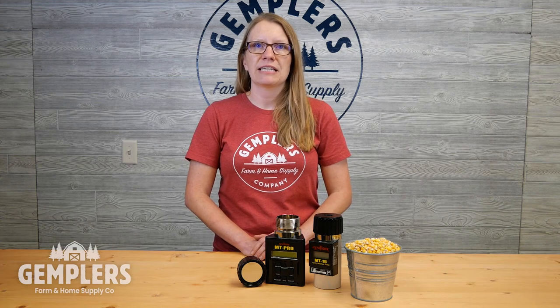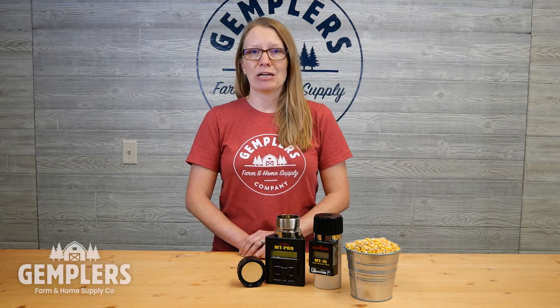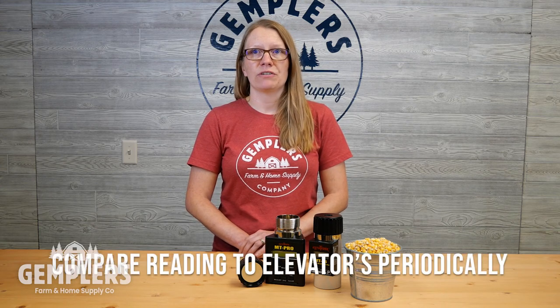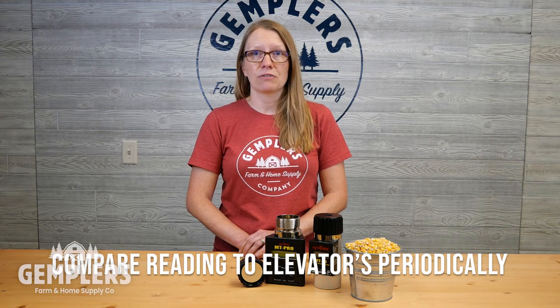Allow cold grain to warm to ambient temperature in a sealed container before testing. If pulling hot grain from a dryer, allow the grain sample to cool before testing. Avoid testing extremely cold or extremely hot grain to help with accuracy. Even if you don't manually adjust the calibration of your tester to better match the readings of your local elevator's moisture tester, you should still compare readings from your tester to readings from the elevator's tester on several samples yearly to check the accuracy.